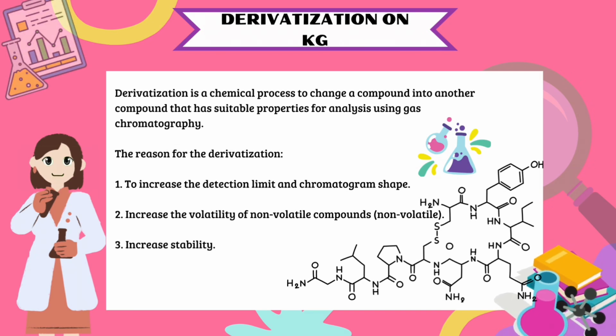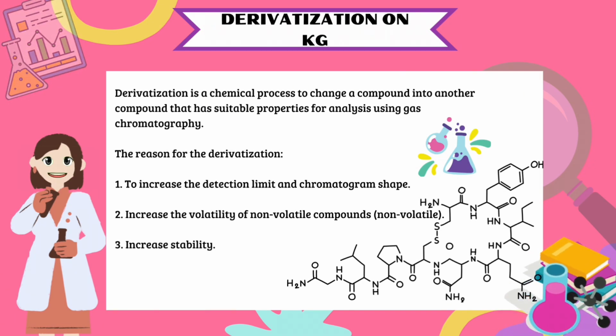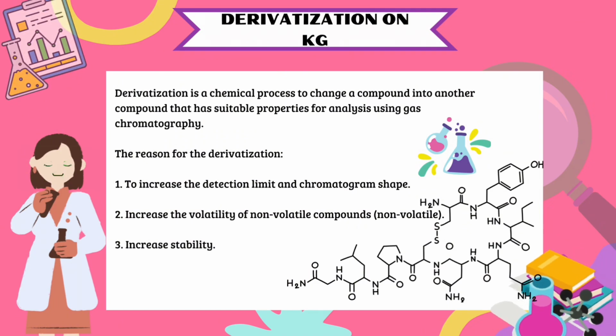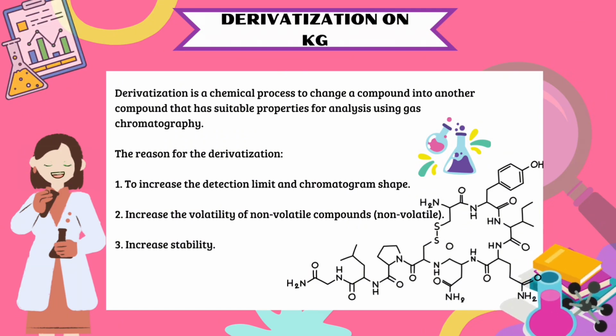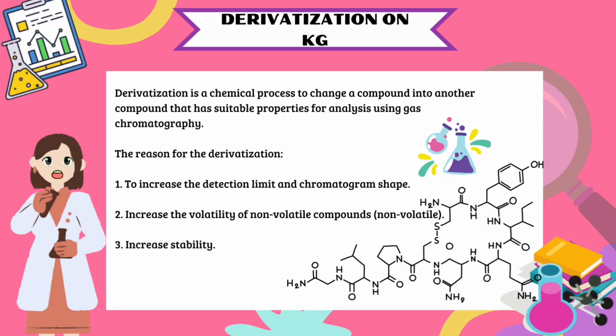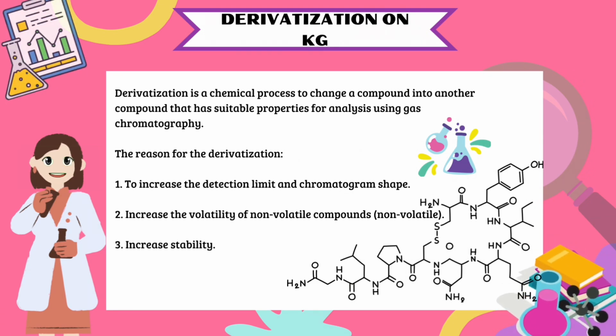Derivatization is a chemical process to change a compound into another compound that has suitable properties for analysis using gas chromatography. The reasons for derivatization: 1. To improve the detection limit and chromatogram shape. 2. Increase the volatility of non-volatile compounds. 3. Increase stability.